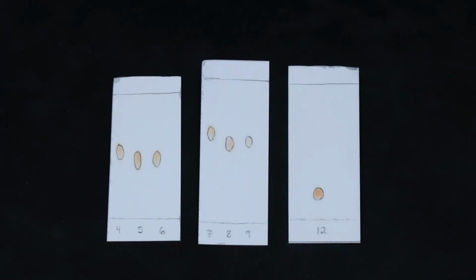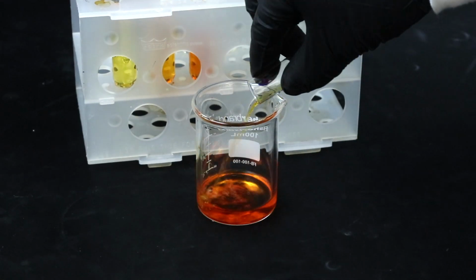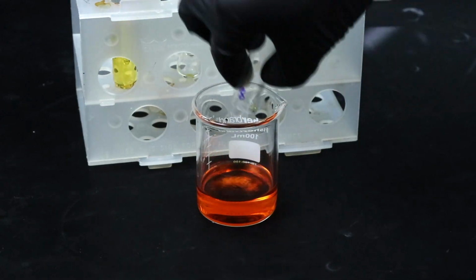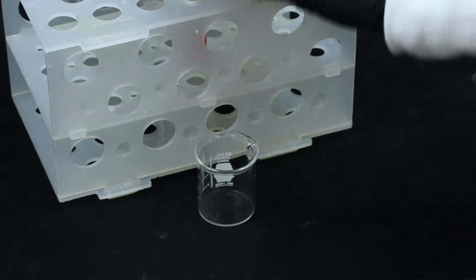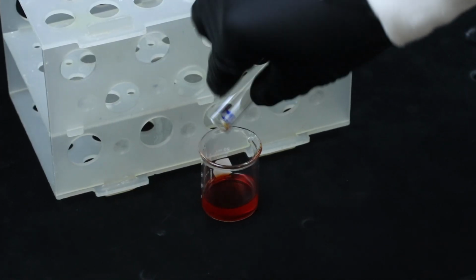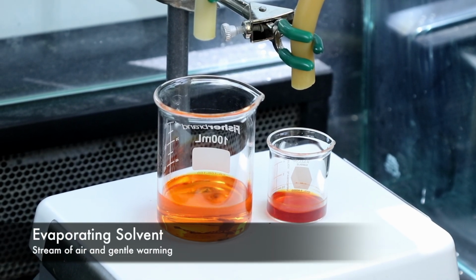And it looks like each of them is pure. I only see one compound for each of the spots, so I can go ahead and combine all of the fractions for the monoproduct and evaporate the solvent. And I'll add the dye product into a beaker as well for a quicker evaporation and start evaporating the solvent in both beakers using a stream of air and gentle warming.